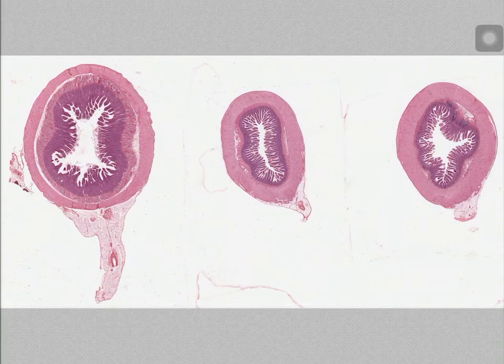So first, before we go into any of the further, I want you guys to see my little pointer. Since there's no arrow on the iPad or anything, I'm going to be using this little guy. If you look on the top left-hand corner of it, that's where I'm pointing at something. Just look at the top left-hand corner always so you can see what I'm pointing at. That's really the best way I can use a pointer on this.